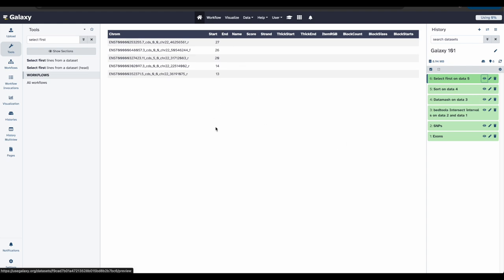Awesome. Now the file only contains the first five lines of the previous data set. We have now determined which exons on chromosome 22 have the highest number of snips. But we can still learn more.